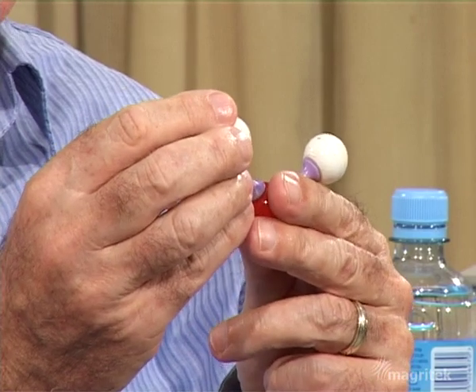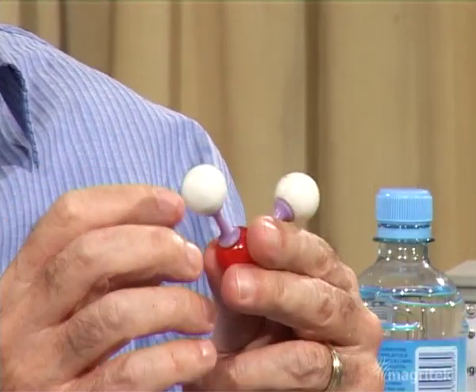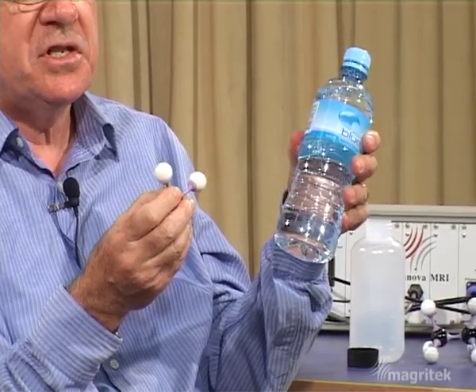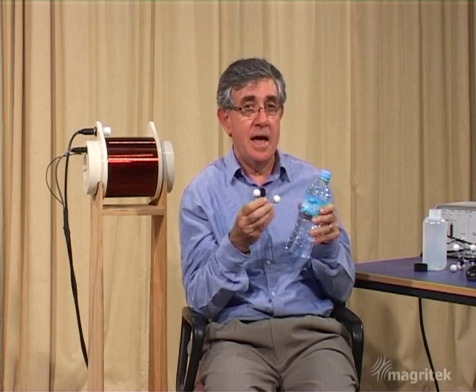Actually, the water molecules are a little more complicated than that because the hydrogen atoms tend to jump from one molecule to another. But we needn't concern ourselves about that. There's an enormous number of water molecules in a container of water like this. In fact, there are more molecules of water in this bottle of water than there are bottles of water like this in all the oceans. That's really a gigantic number. So we're going to have plenty of atomic nuclei and plenty of nuclear magnetism to play with.